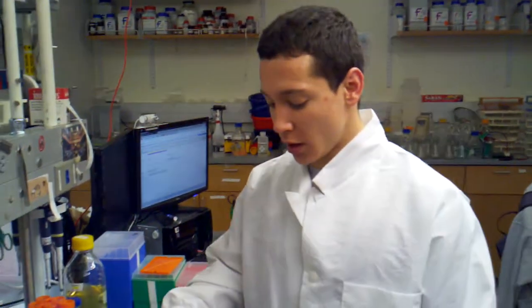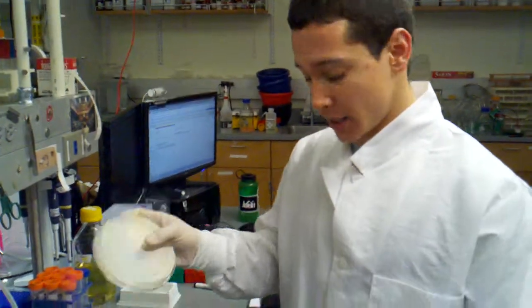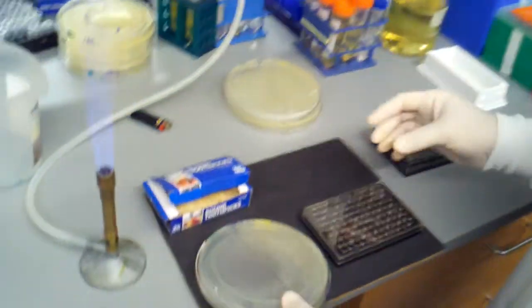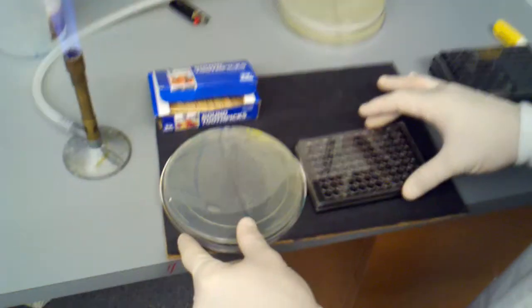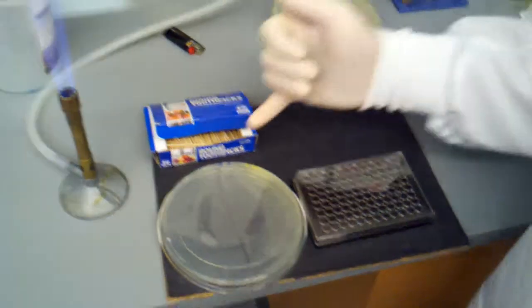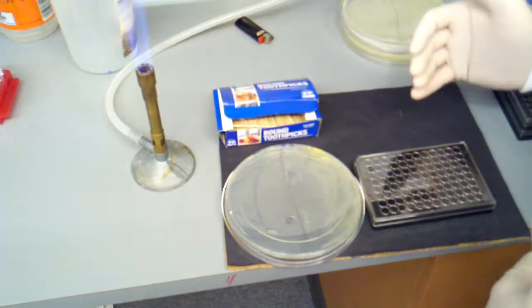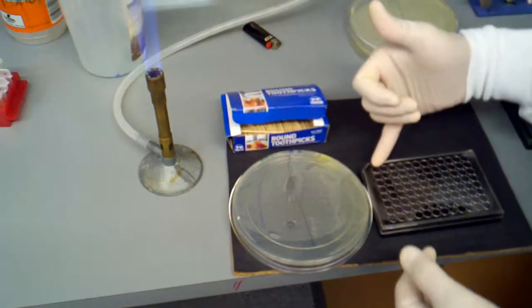Now we're going to be picking our colonies from our plate into our 96-well deepwell plate here, and we're going to be using sterile technique. I'm going to show you how to do it in such a way so that you remember where you've gone and that you don't pick into the same well twice or pick the same colony twice.